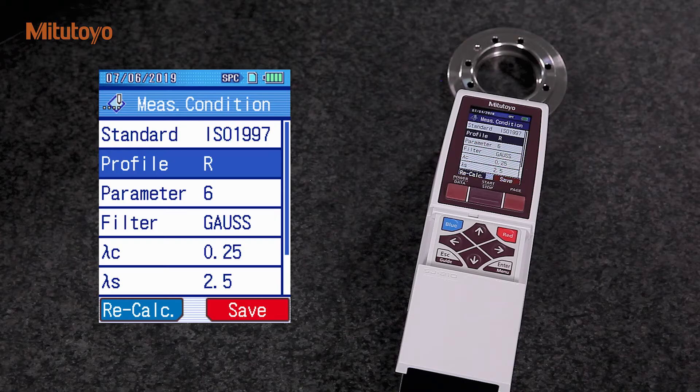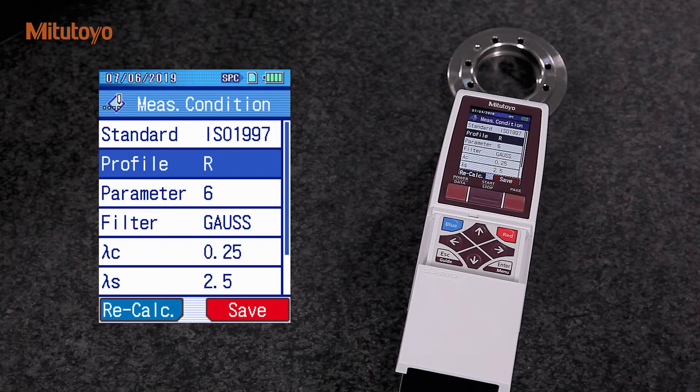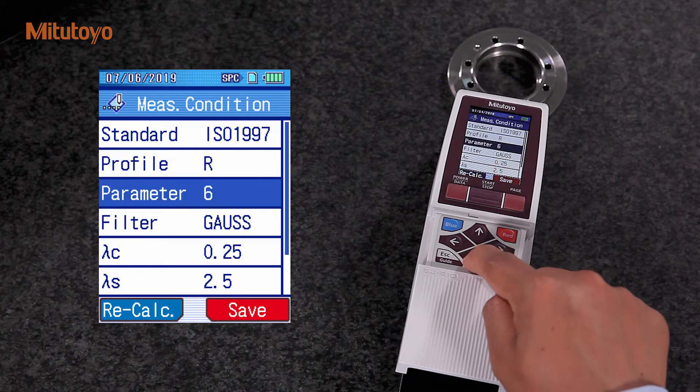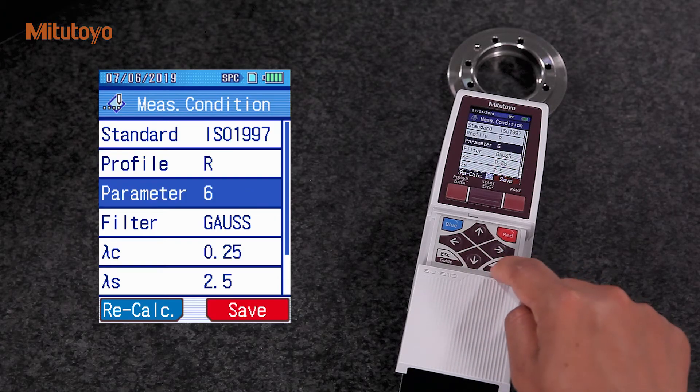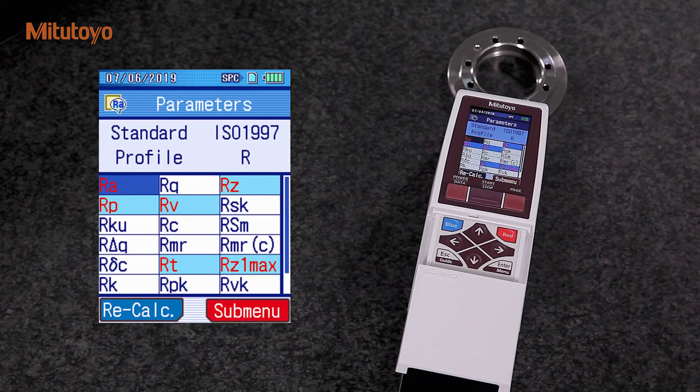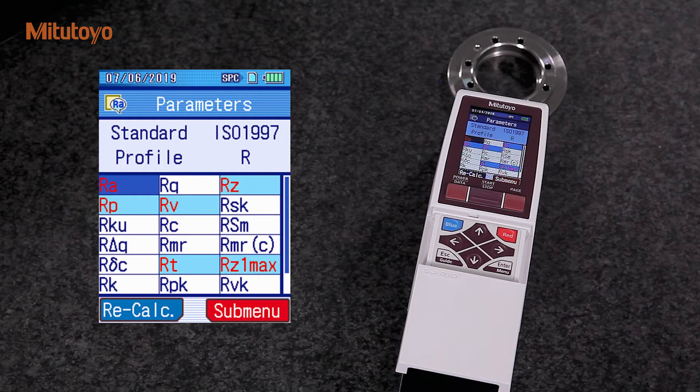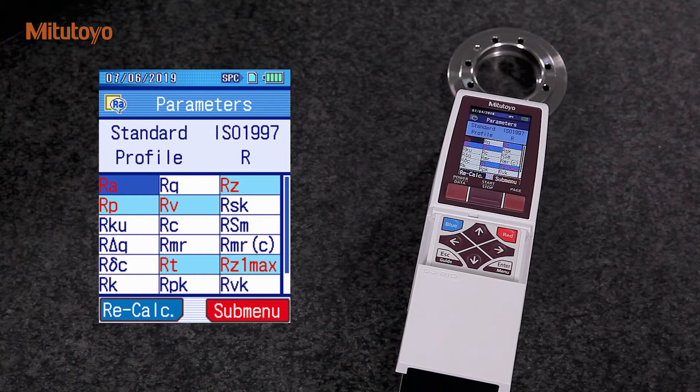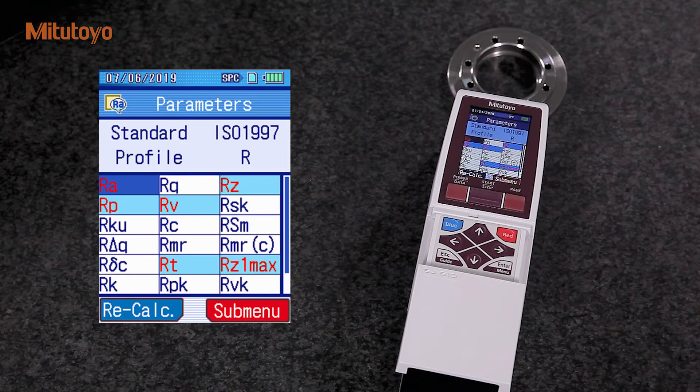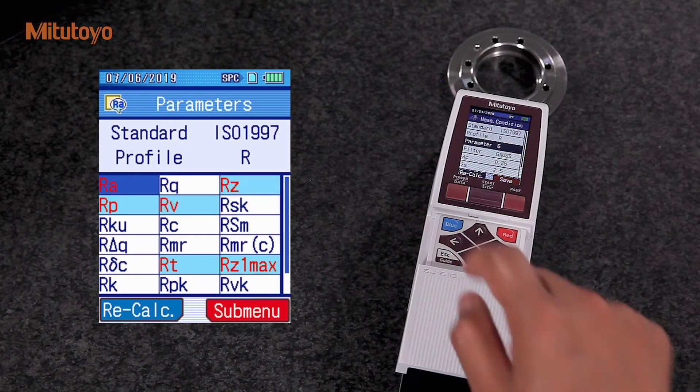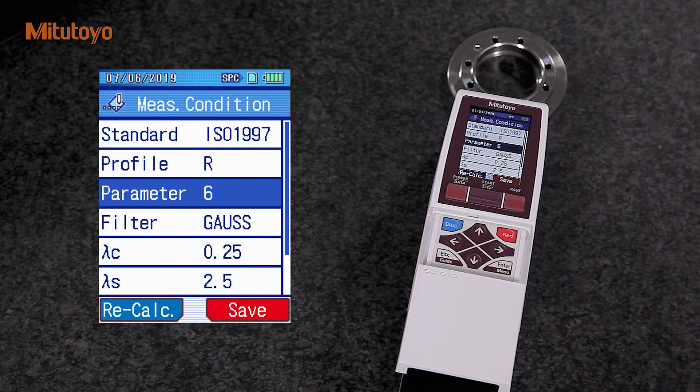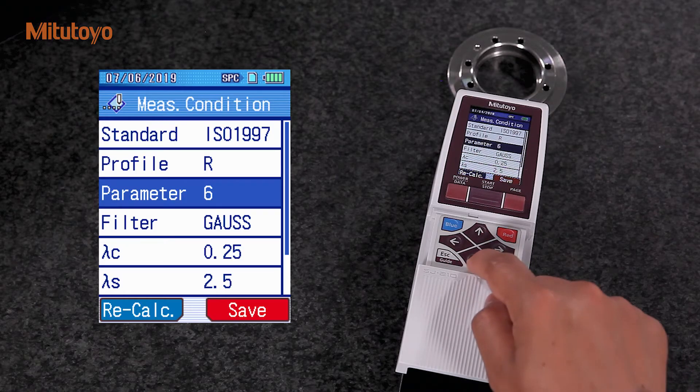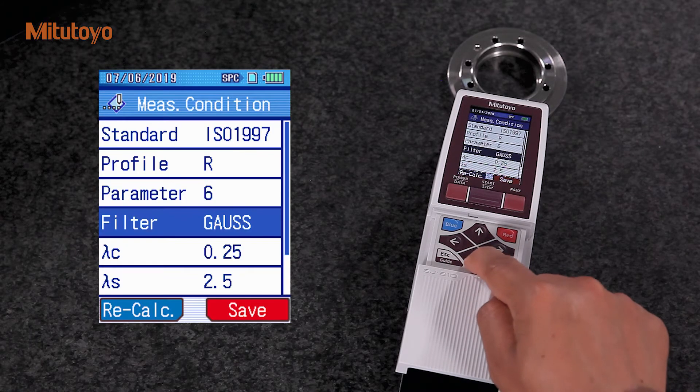Then, we define the roughness parameters. SJ-210 supports various roughness parameters. We use the Gauss filter for this measurement.